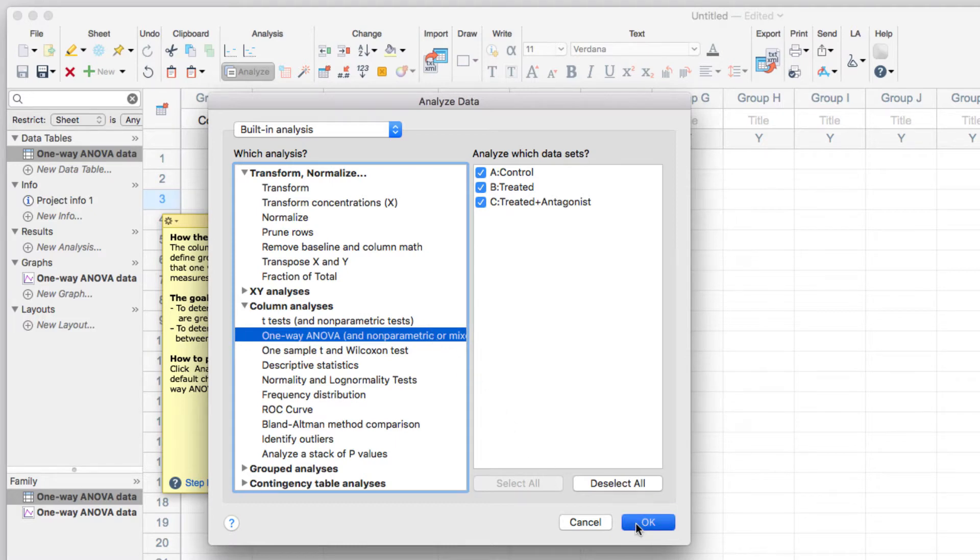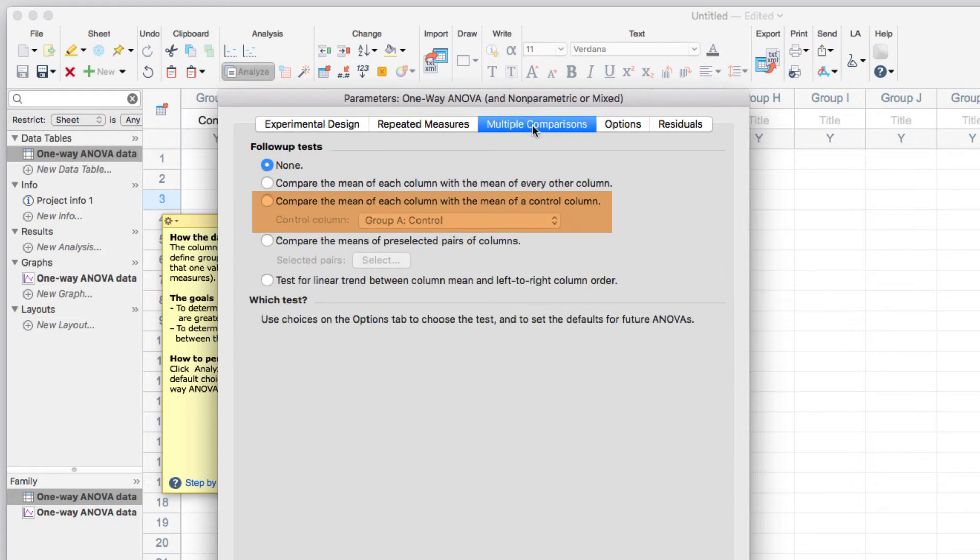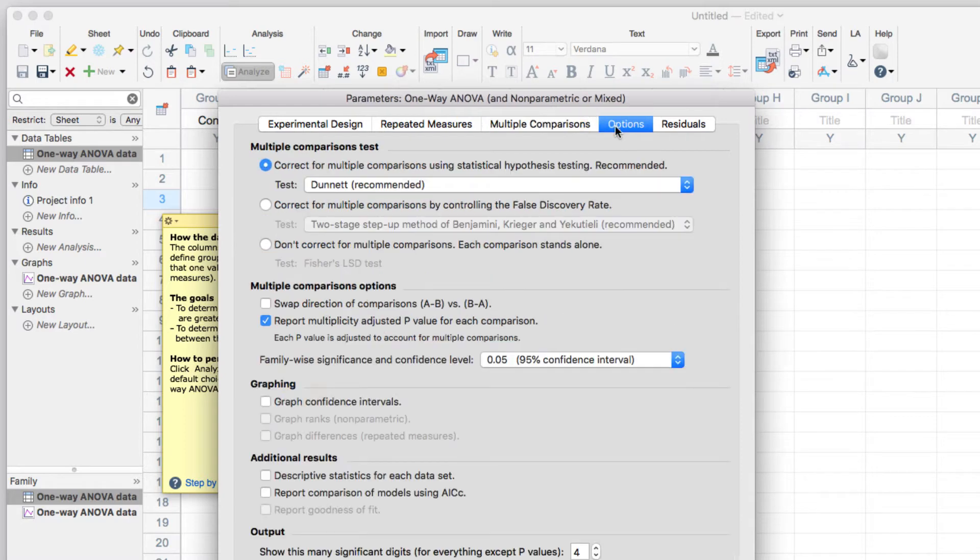Specifically for this test, I want to look at multiple comparisons of the data by comparing the mean of each column with the mean of a control column, in this case, control group A. And under the options, I want to create a graph of the confidence intervals.